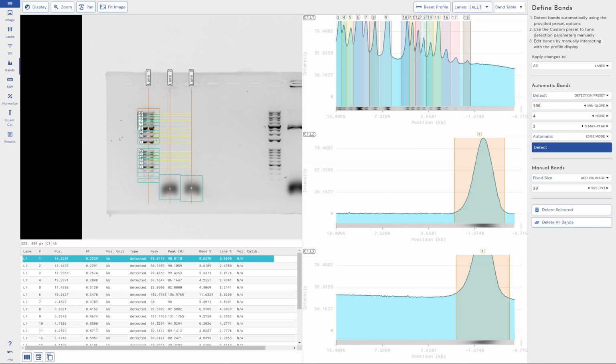I think that's everything that we've got around the world of molecular weight sizing and calibration and quantification of unknown DNA bands within the software for now. Of course, it's always liable to change. We're constantly improving, constantly updating our Phoretix 1D software.